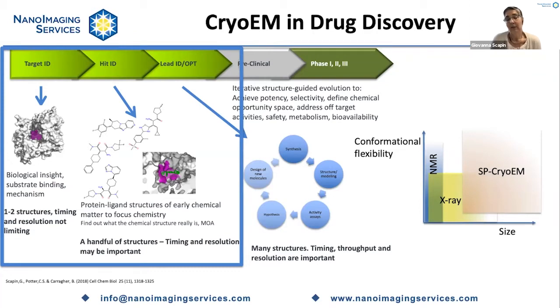Now, in the past few years, we have seen many, many examples that prove how much cryoEM has contributed to the early stages of drug discovery, and how much of the conformational and size space cryoEM has brought to life, giving us access to structures that a few years ago were completely unthinkable, not just of membrane proteins or larger assemblies, but also things in motion, molecular machines, things that move in order to carry out their own functions, and we are now able to see them.